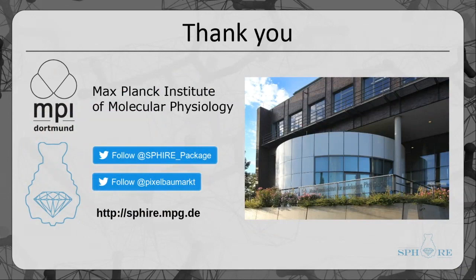Perfect. Hello. Yeah, my question is just about instead of augmenting the data, to explicitly put in the assumptions that go into the encoding, like symmetries, into how the objective sees the data, so that something that is flipped appears as the same thing, and so that you don't have to augment it. Sometimes that can be done with the filters, with different symmetries in the convolutional filters. Yeah. I haven't seen anyone do that too much though for cryo-EM data.